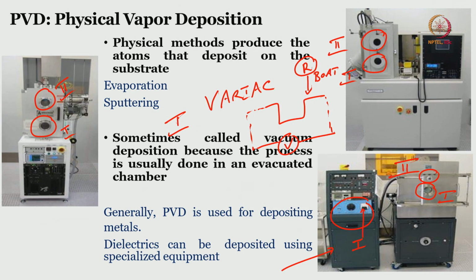So, when it starts heating up, the material within it will start melting, correct. To apply this voltage, we use this variable AC variac, and you can observe the current in the current meter here. So, that is the reason of having this particular block.